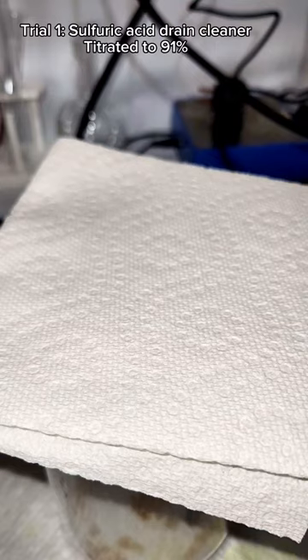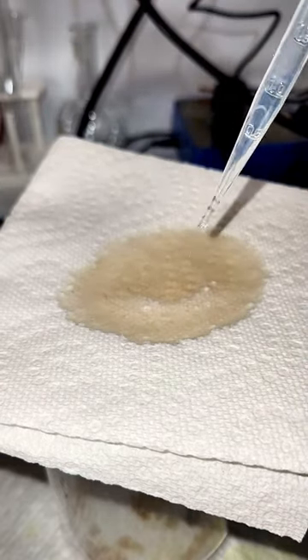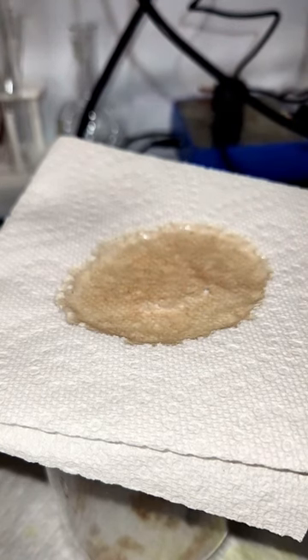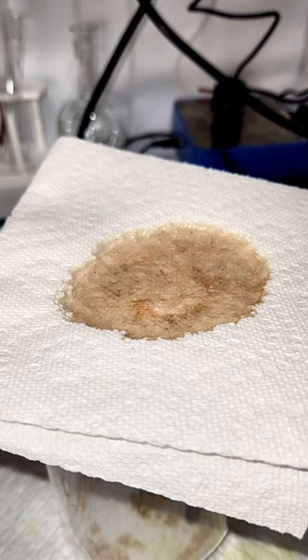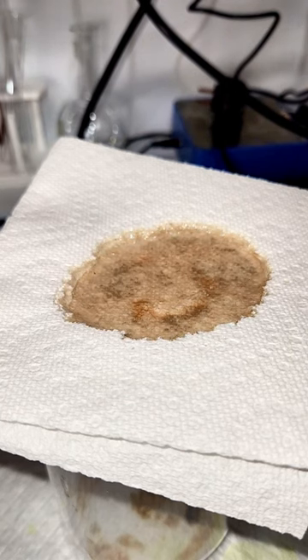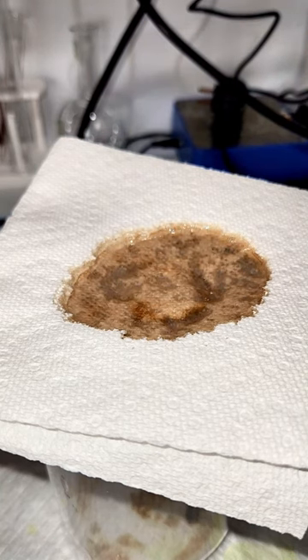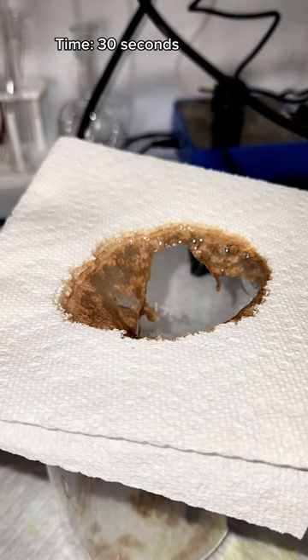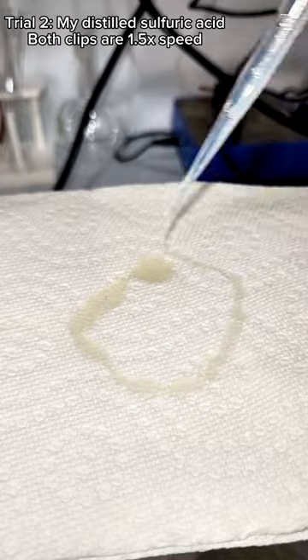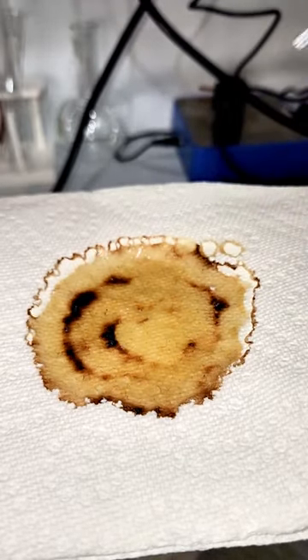I want to test my distilled sulfuric acid against the store-bought stuff, which I titrated to 91%. For this test, I basically want to see how long it takes for each sample to eat through four sheets of two-ply paper towel. These clips are both run at 1.5x speed to save time, and even still you can see that the sulfuric acid drain cleaner from the store dissolves through the paper towels pretty sluggishly. It takes a full 30 seconds to get through, and this is partially due to the higher water content, but also because store-bought sulfuric acid contains stabilizers to prevent it from destroying your pipes.